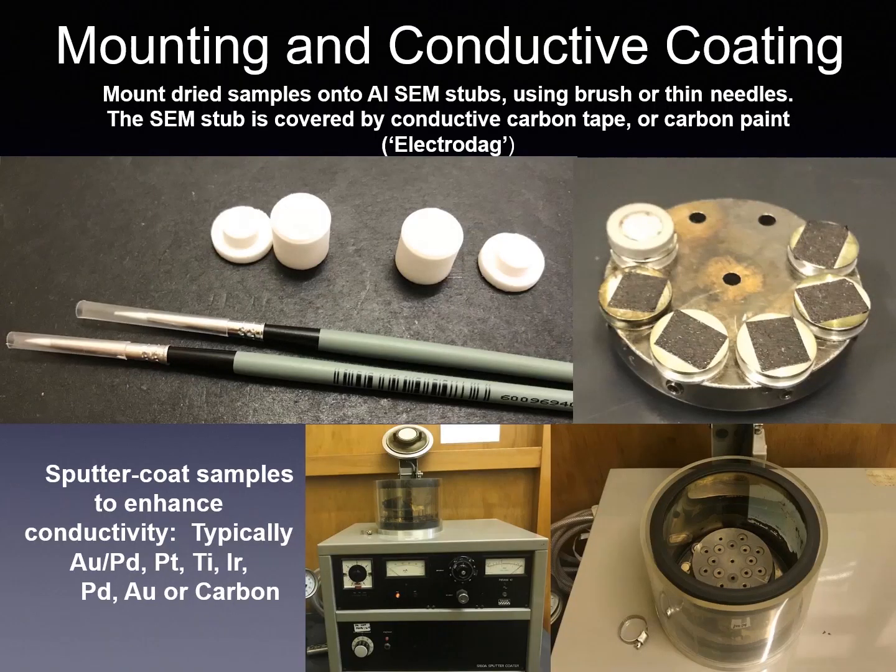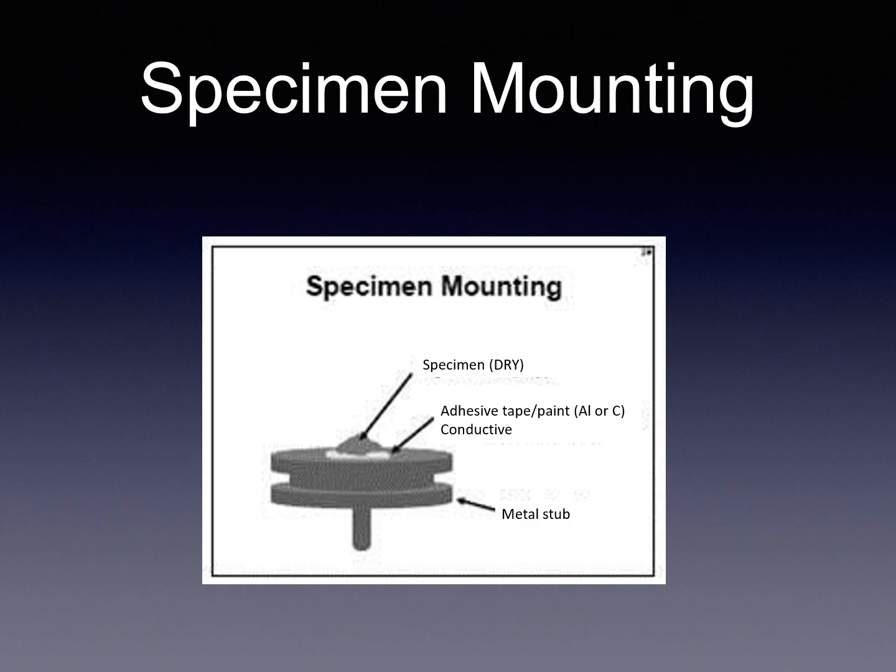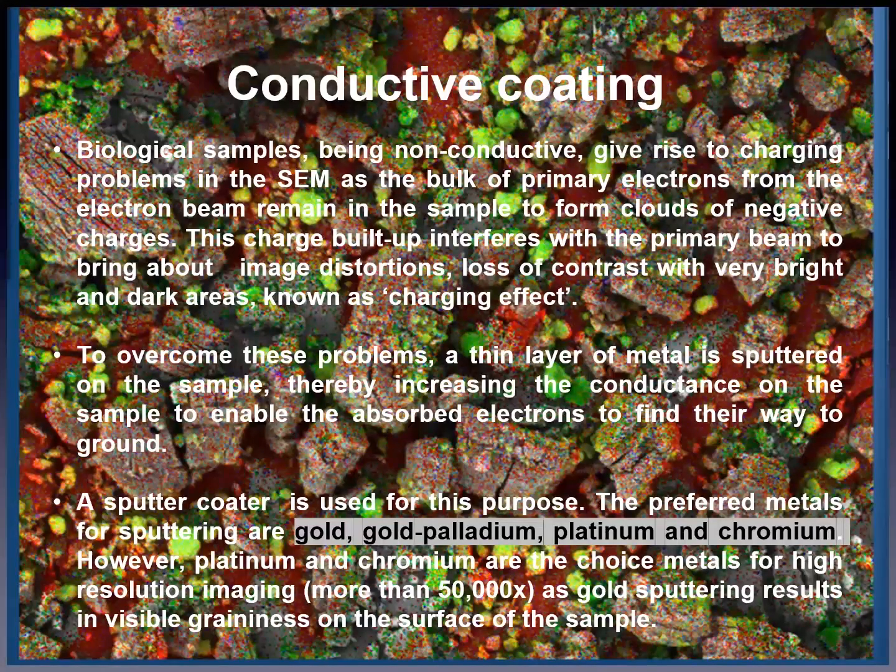Sample mounting and conductive coating: mount dried samples on aluminium SEM stubs using a brush or thin needles. The SEM stub is covered by conductive carbon tape, carbon paint or Electrodag. Sputter coat the sample to enhance conductivity, typically with gold, gold-palladium, or another metal or carbon. Biological samples being non-conductive give rise to charging problems in the SEM, as the bulk of primary electrons from the beam remain in the sample forming clouds of negative charge. This charge build-up interferes with the primary beam to bring about image distortions and loss of contrast with very bright and dark areas, known as the charging effect. To overcome these problems, a thin layer of metal is sputtered on the sample, increasing conductance to enable absorbed electrons to find their way to ground.